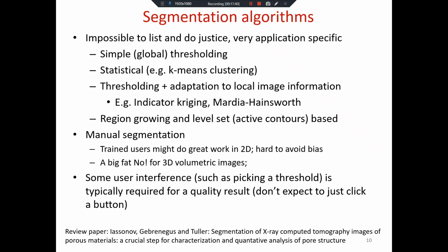Where it's resorted to is in analysis of thin sections. It's so-called point counting, but all that's done is a program puts a raster of points, a grid of points, and then the trained user decides for all of those points: did it fall into a pore, which is epoxy, so it's often blue? Right? Is it pore, is it microporous, or is it grain?